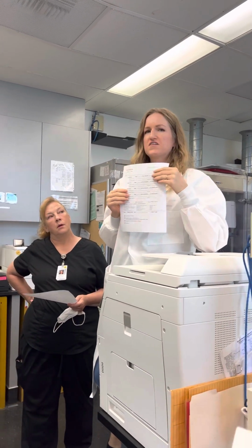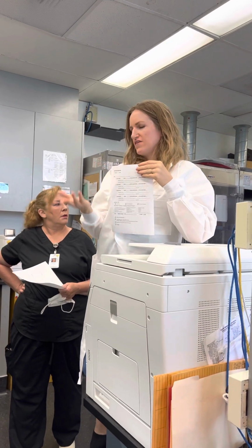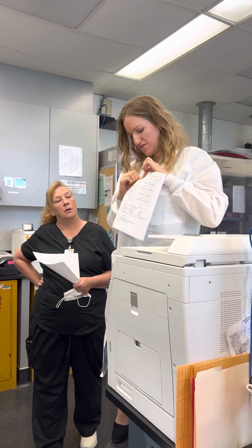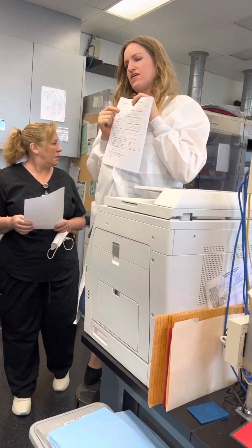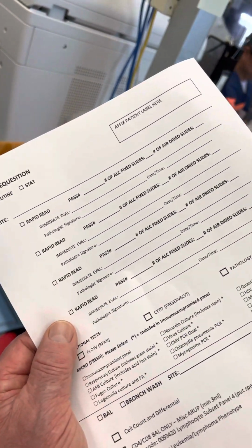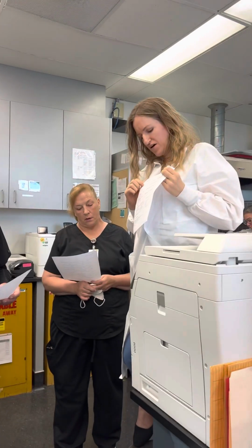So first we're going to talk about the rapid read stuff. You're making smears on your very first site. You're going to fill out this paperwork with this site here. That's going to be your 4R or whatever station you're taking from. And you're going to check off this box that you want a rapid read, because sometimes slides are brought to us and nobody's waiting for a rapid read. So we need to be told if you are expecting a rapid read done and a phone call. So that box will be checked off.